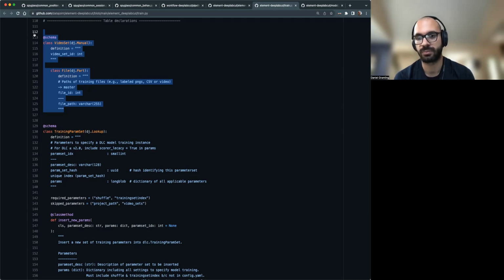DeepLabCut is always looking for what's on disk. Along the spectrum of how deep into DeepLabCut we are digging and pulling functions out of, versus scratching the surface, we're only going one layer deep, beyond the GUI: here's the command to launch training, not let's manipulate the command to launch training to look at the DataJoint database. We didn't go that far, anticipating that DeepLabCut is going to go through some developments, and going to the root is going to result in some breaks, depending on what they decide to develop.